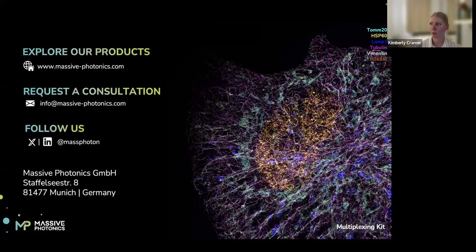And this really helps you because one of the common mistakes when you're switching to DNA paint in comparison to STORM is that when you're setting the focal plane on your microscope, in STORM, for example, you have a dye to set the focal plane. Whereas in DNA paint, if you don't have a fluorescent protein, then you need to kind of follow the blinking with your eye. And this is something that takes a little bit to train if you're new to it.